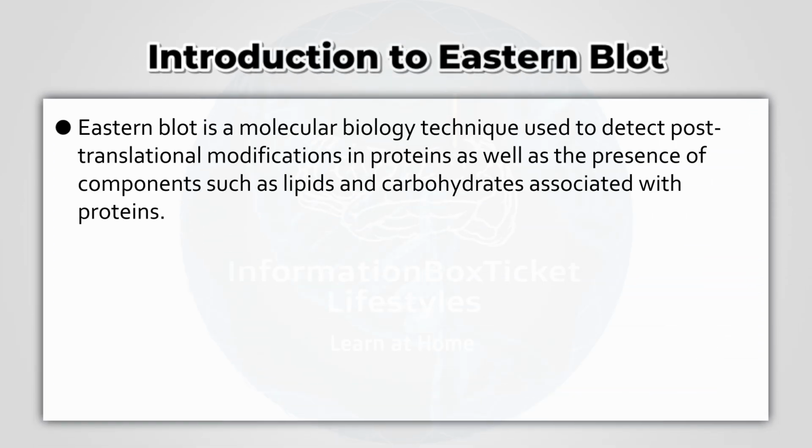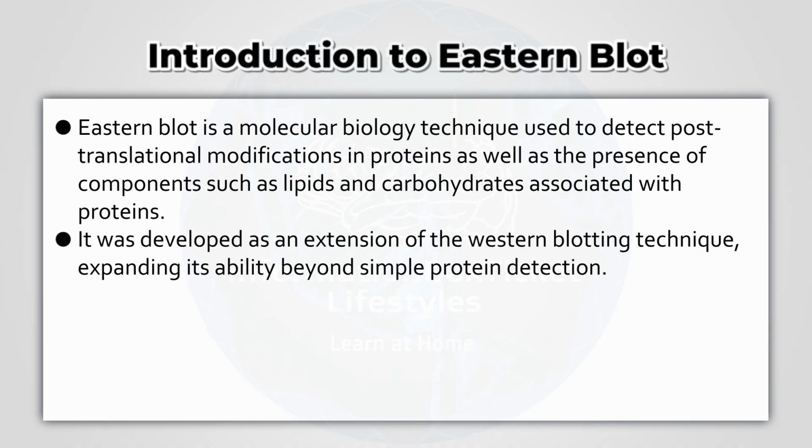Eastern Blot is a molecular biology technique used to detect post-translational modifications in proteins, as well as the presence of components such as lipids and carbohydrates associated with proteins. It was developed as an extension of the Western blotting technique, expanding its ability beyond simple protein detection.